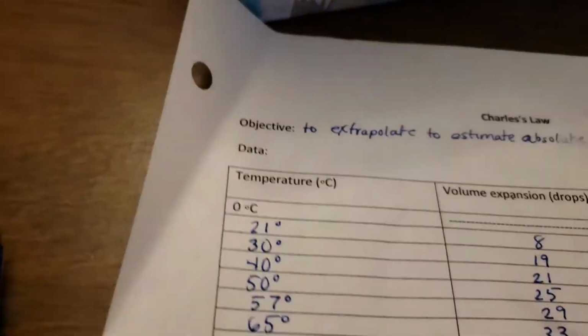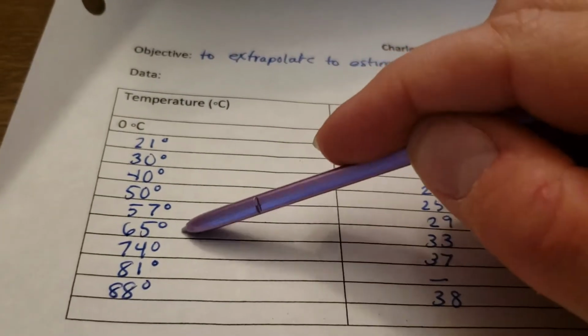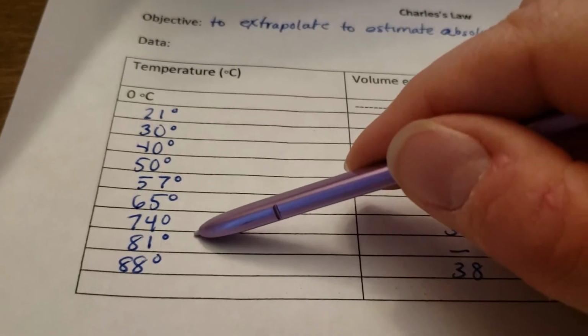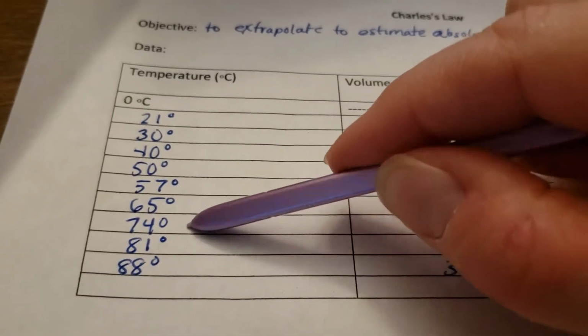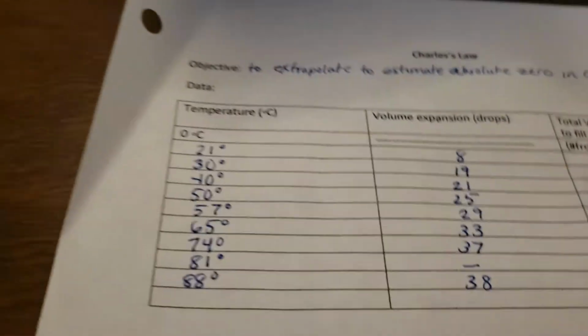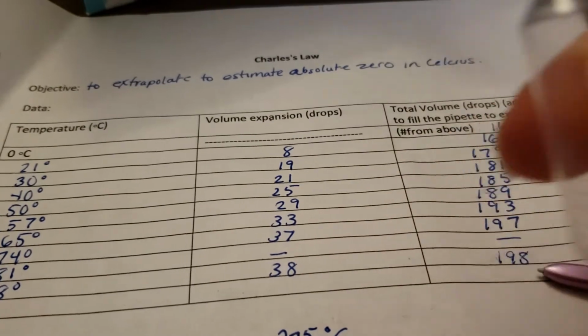So then I just continued heating it up, a little at a time: 30 degrees, 40, 50, and then it started to get a little more difficult, 57, 65, 74. And then the last trial I did was 88 degrees Celsius. At 88 degrees Celsius, it essentially started melting my little pipette.